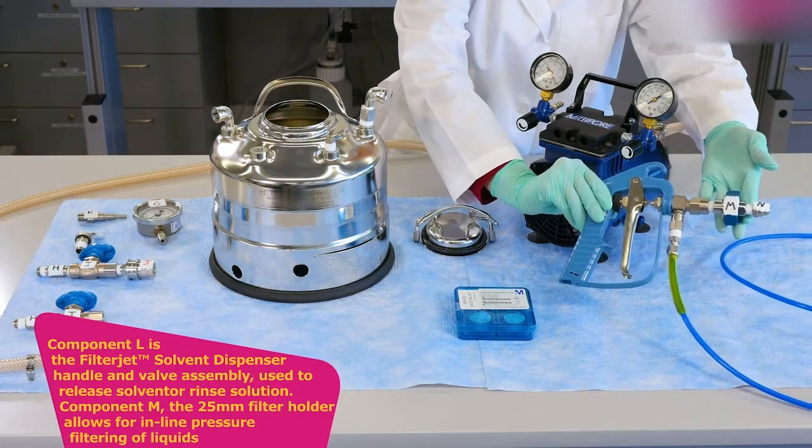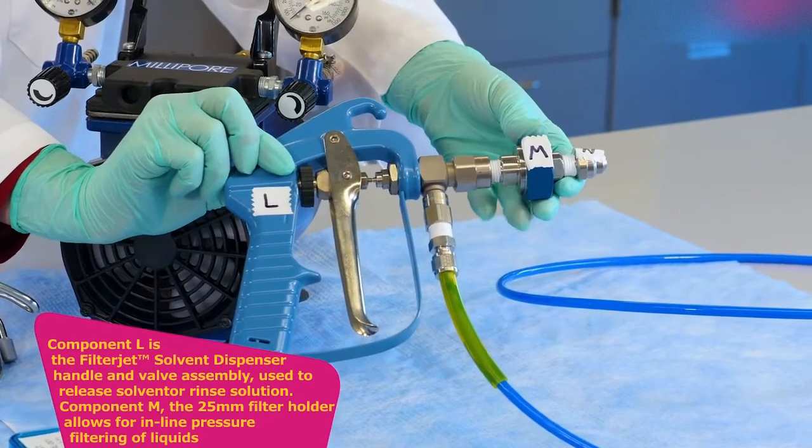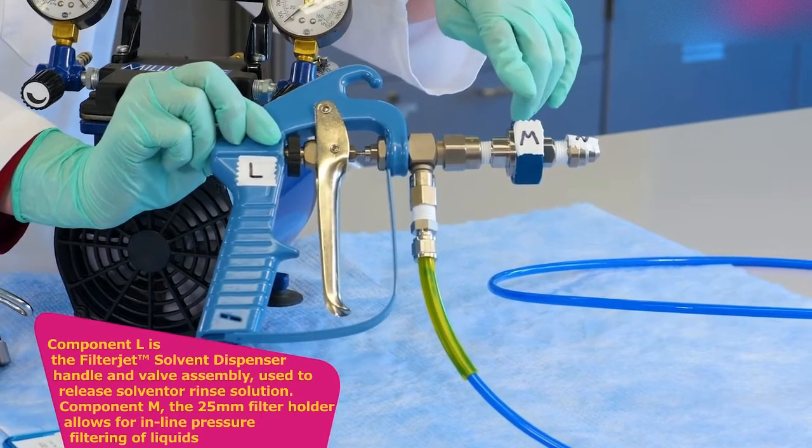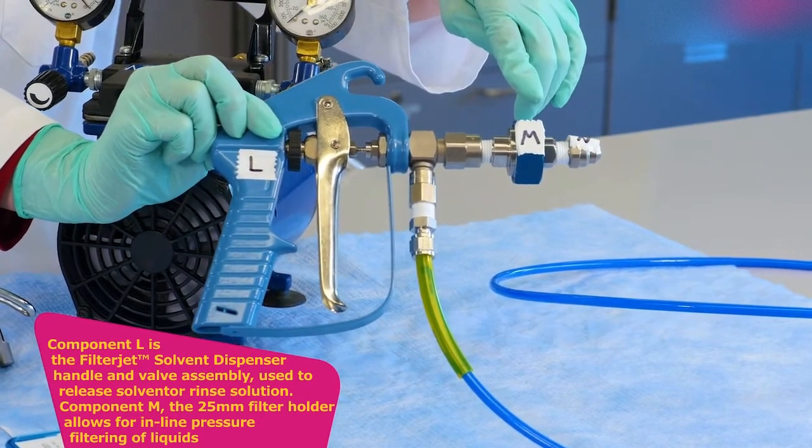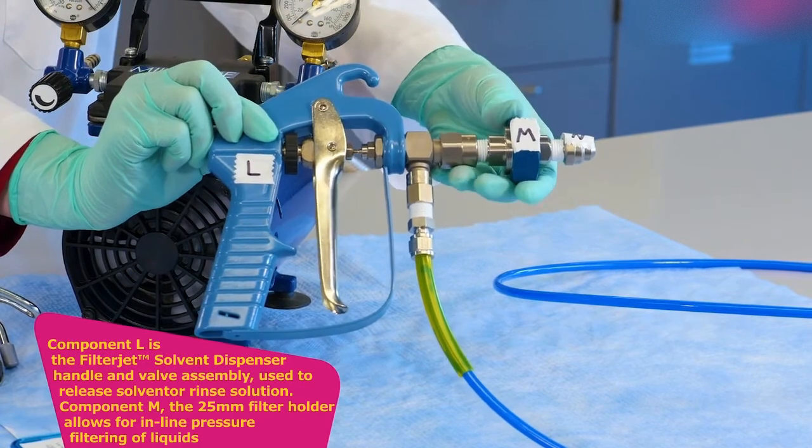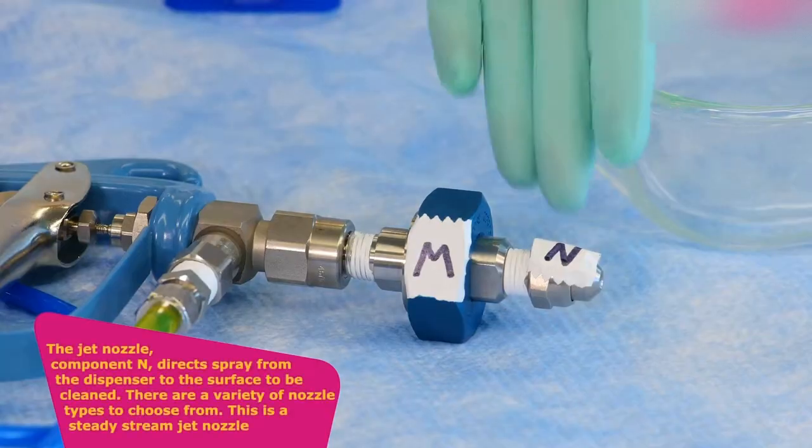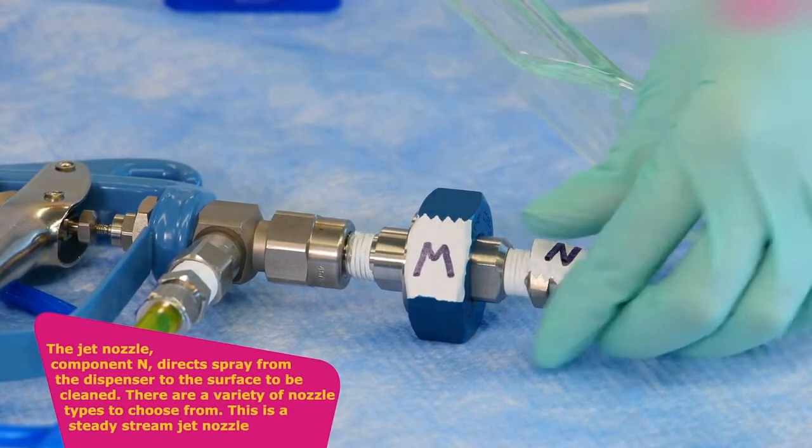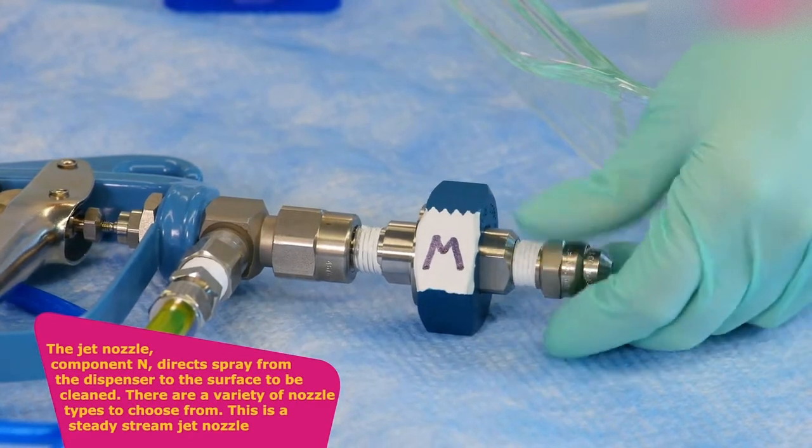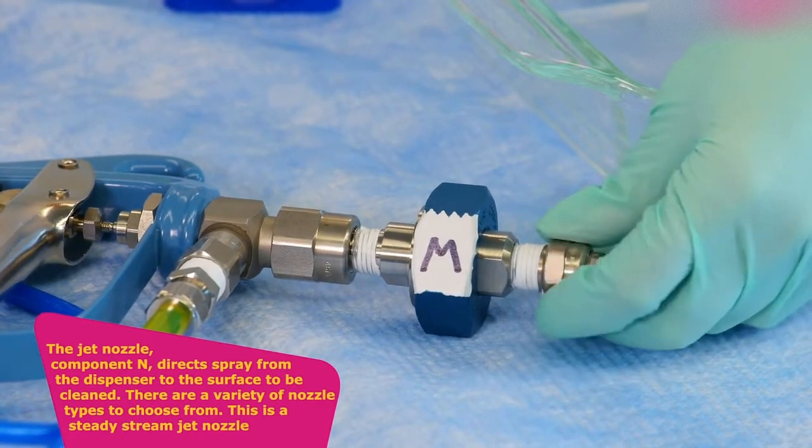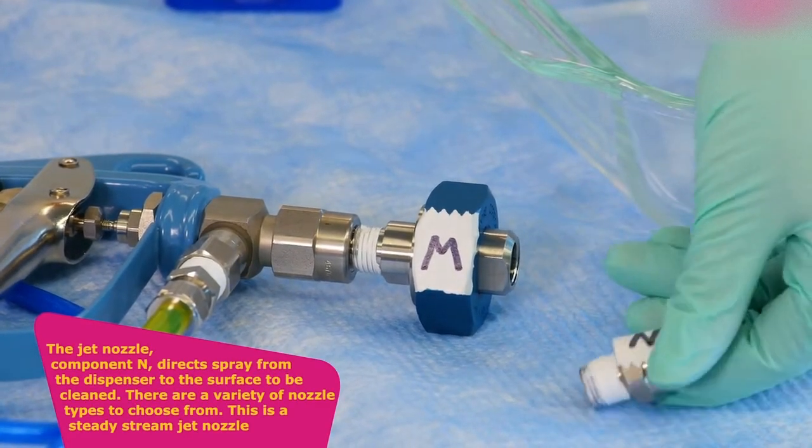Component L is the filter jet handle and valve assembly used to release solvent or rinse solution. Component M, the 25 mm filter holder, allows for inline pressure filtering of liquids. The jet nozzle, component N, directs spray from the dispenser to the surface to be cleaned. There are a variety of nozzle types to choose from. This is a steady stream jet nozzle.